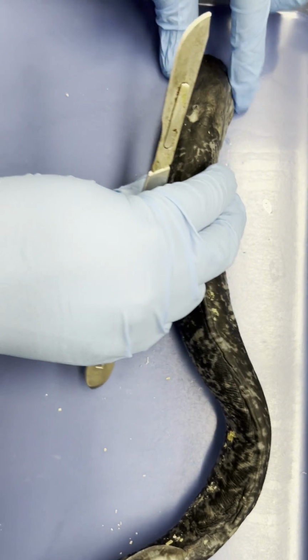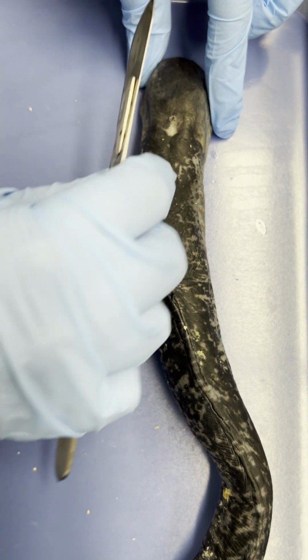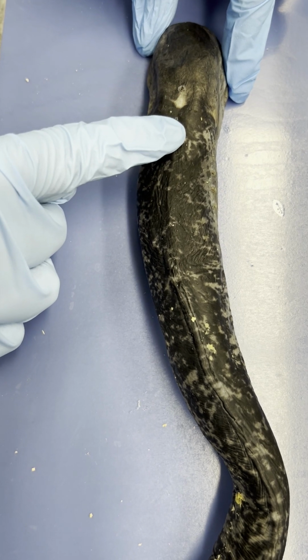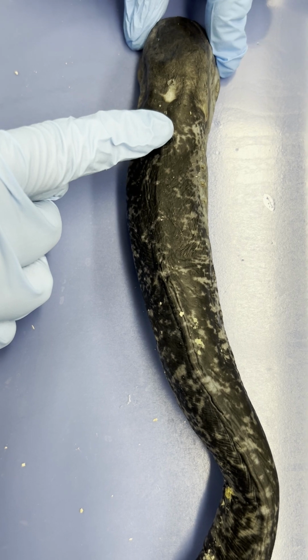So we're going to be as careful as we can, but sometimes when we make these cuts, we don't get perfectly on midline. It's also an extra challenge with the preservatives that are here because sometimes things are preserved in a slightly abnormal position.